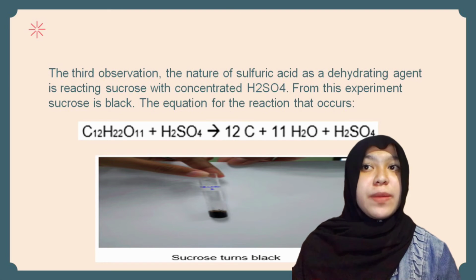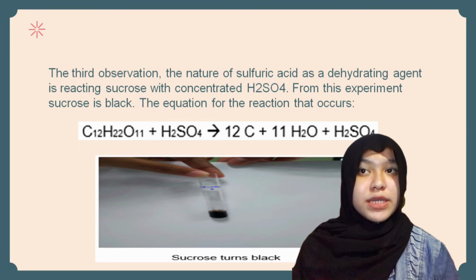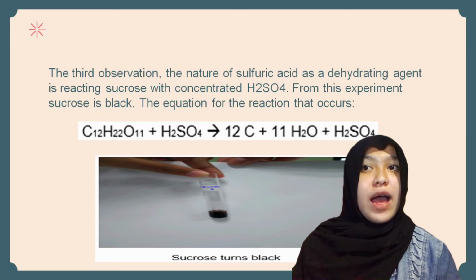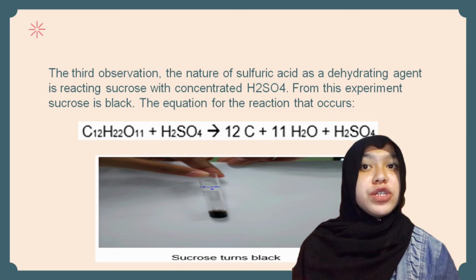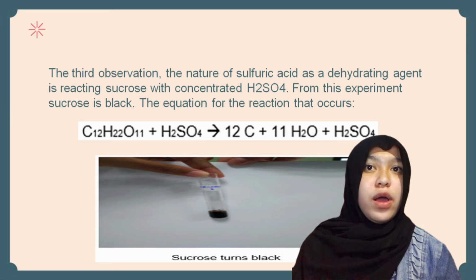From this experiment, the sucrose turns black. The equation for the reaction that occurs: C12H22O11 plus H2SO4 produce 12C plus 11H2O plus H2SO4.